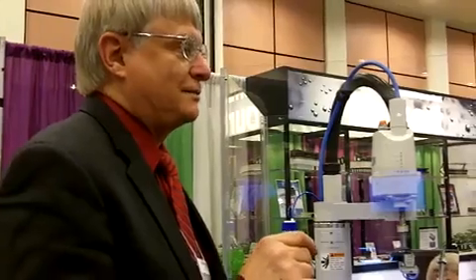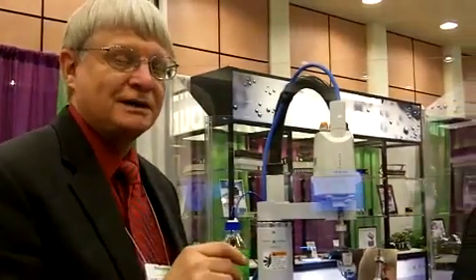Hi, I'm Tim Stutt. I'm the editor-in-chief of Laboratory Equipment Magazine, and we're at Lab Automation 2010 at the Berkert booth. We're with Craig Ocato, and he's going to tell us about the products that he's exhibiting at the booth.